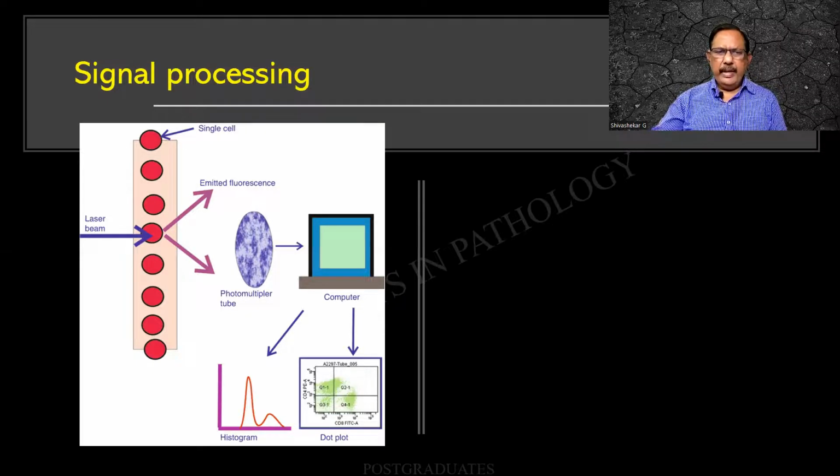All these are being assessed and captured, and it passes through the series of tests finally onto the computer, through which I can get either a histogram or it can be a dot plot by which I get the values. A very simple one which you people shall and will not only remember but explain. A beautiful diagram as such. But please remember 7 dimensions.